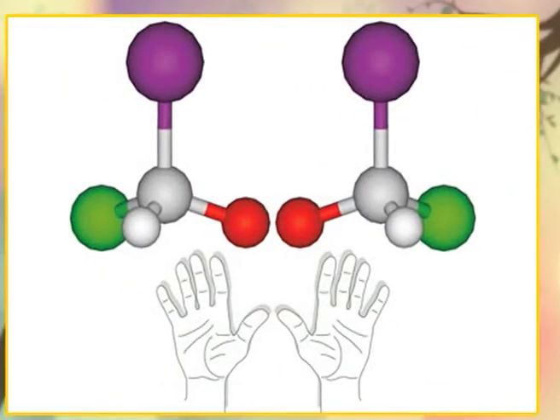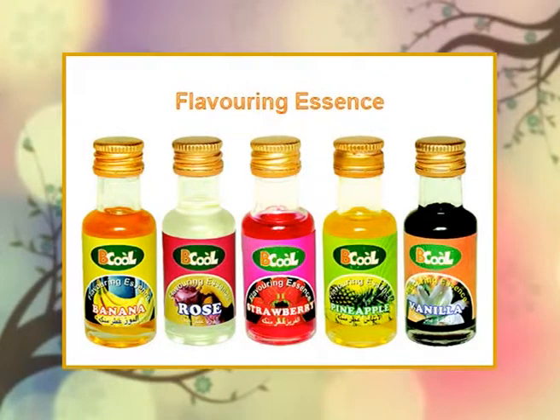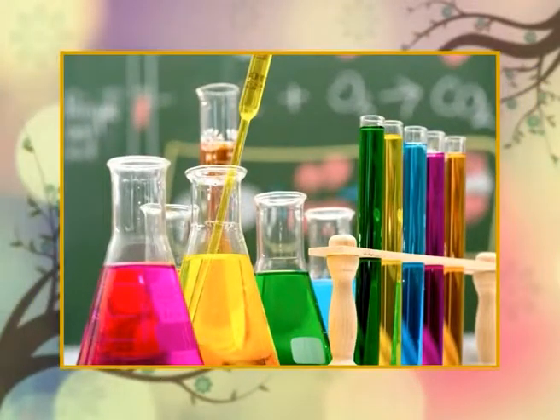The technique has many applications. In industries that produce or use chiral organic molecules in pure or diluted form, rotation of mixtures like food ingredients, perfumes, flavorings, chemicals, and pure or formulated pharmaceuticals are observed.